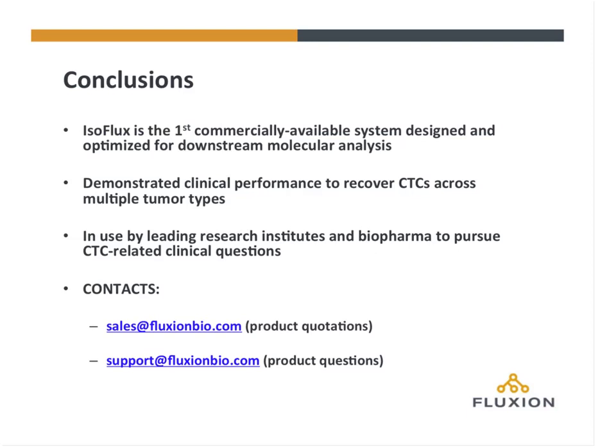Okay, there's a question about the purity of CTCs collected from the eluted volume. The purity of the sample is generally between about 2 and 20%, which in absolute terms means that a typical CTC sample will have anywhere from 5 to 100 CTCs, and the total amount of cells, which includes any kind of white blood cell carryover, is going to be about 500 to 2,000.